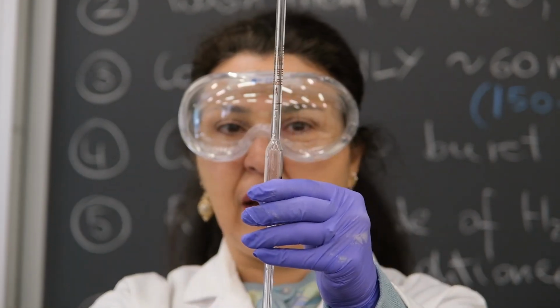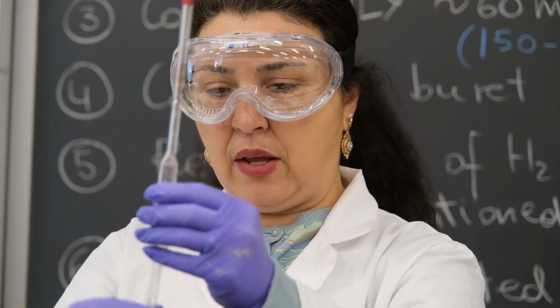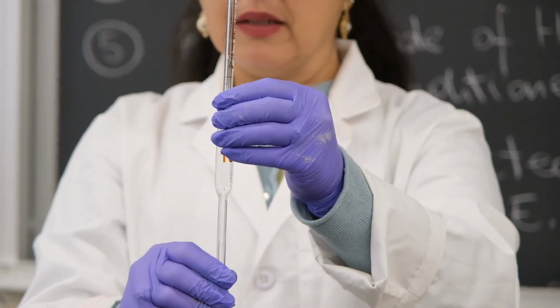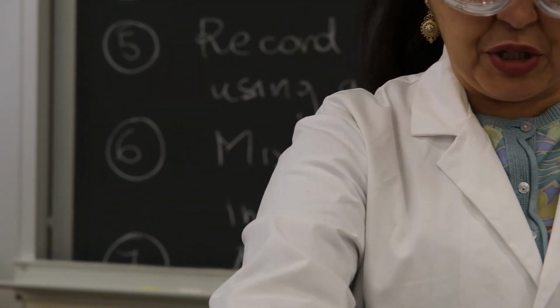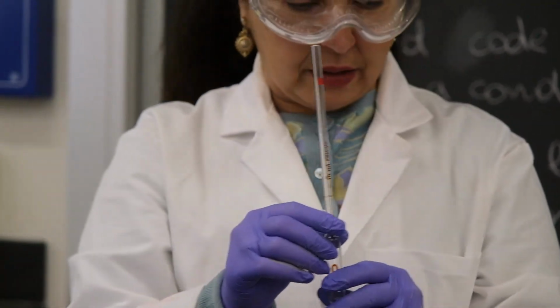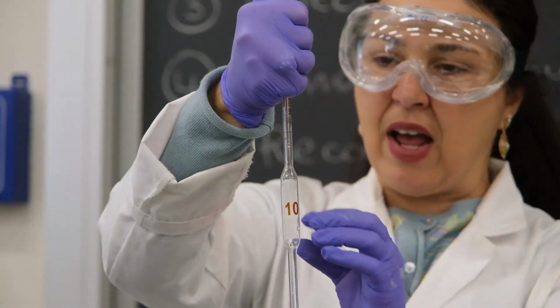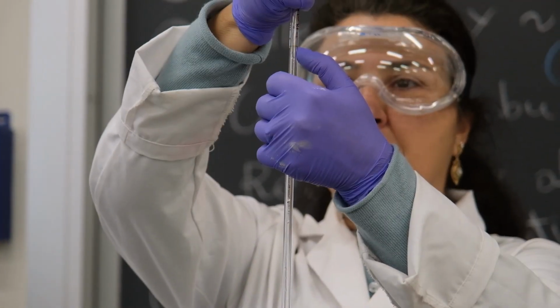First you rinse it with the deionized water, then you rinse with a little bit of your solution so that you have the 10 milliliter volumetric pipette clean, and you don't dilute your original solution. And then you collect 10 milliliters, you transfer, you collect always more, and then with your finger, so practice in advance if you don't remember how to do it, you go to the meniscus.